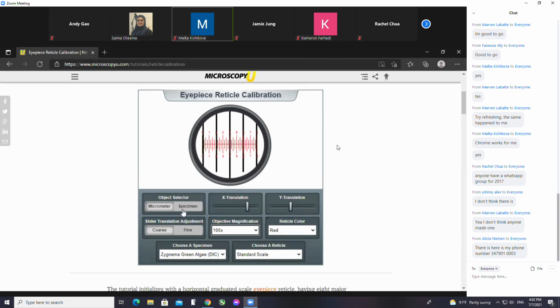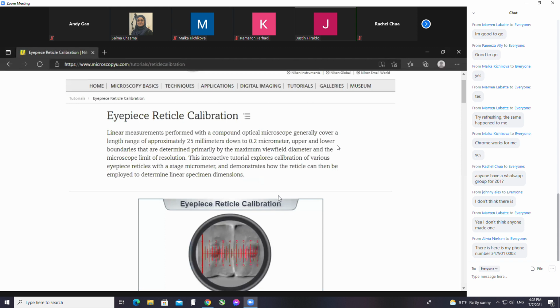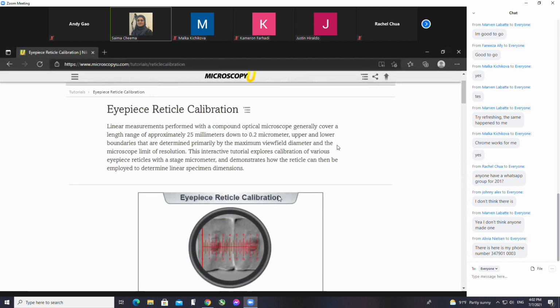Professor, so then for every one of the ocular ruler divisions, it will be 32? Right, because if you're counting the whole thing, then it's going to be 32. If you're counting half of them, it's going to be 16. So since we counted 32, then yes, it should be 32. And if that's what you're going to continue to count, then yes, for all of them. Okay, thank you.